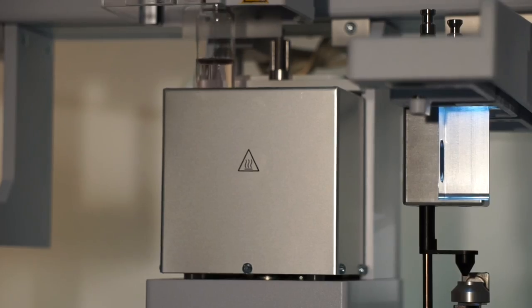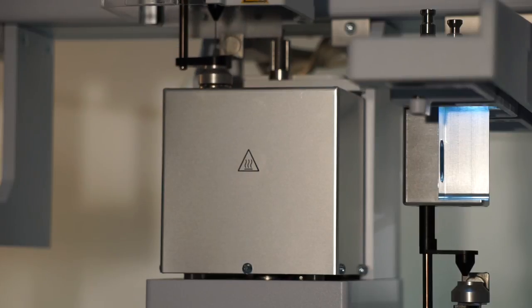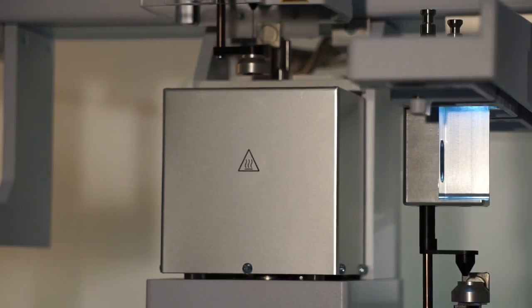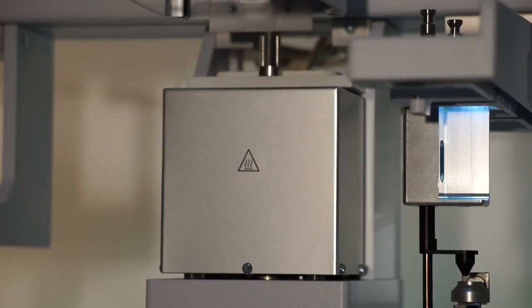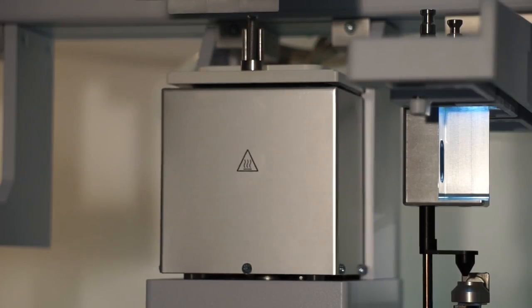There the vial is heated with a temperature from 30 to 200 degrees Celsius and can be shaken optionally with a velocity from 250 to 750 rpm.